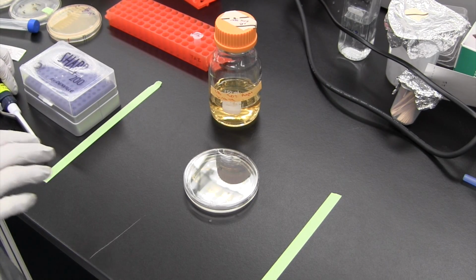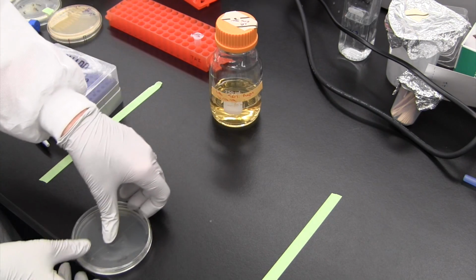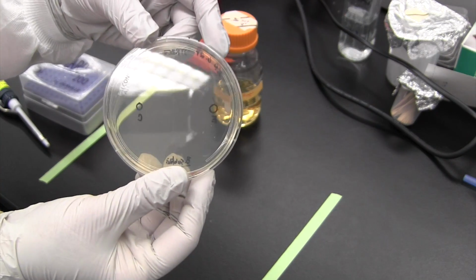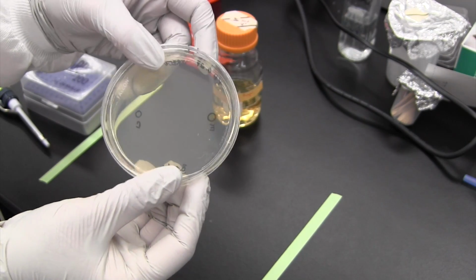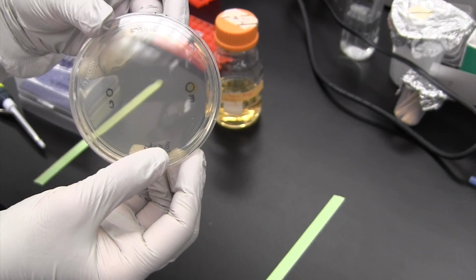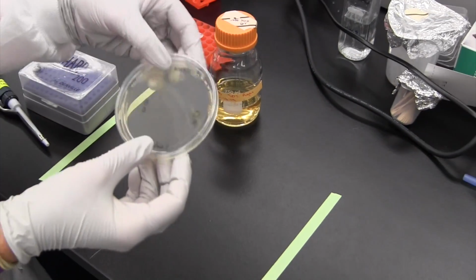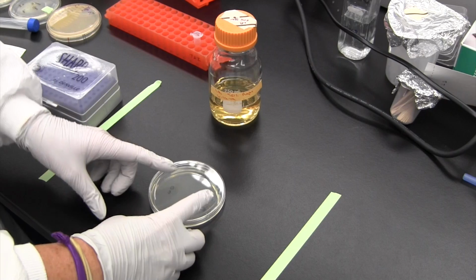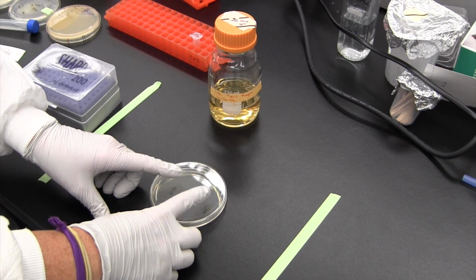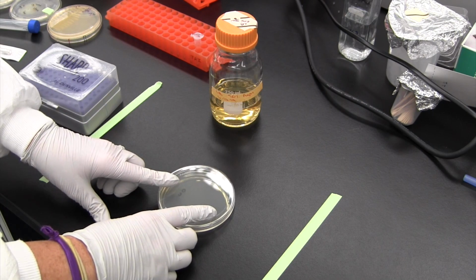Okay, so we're going to finish up our final stage, we think, of the chemical extraction. As I showed in the last video, we've dotted our plate so that you can now see there's an orange hue where our extract is, and it's dried. You normally won't see too much in the control region because that's hopefully just been your ethyl acetate that has evaporated off. You want to be sure with these plates that you space them pretty far apart. You don't want to put them too close because that can complicate the interpretation of the results.